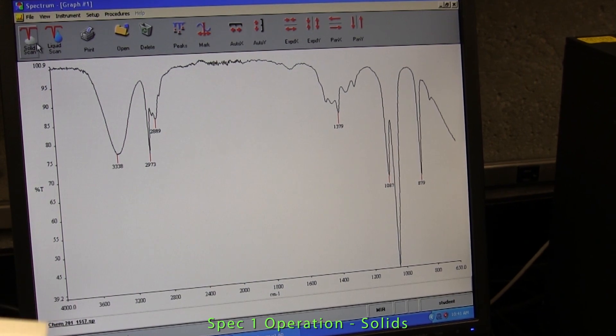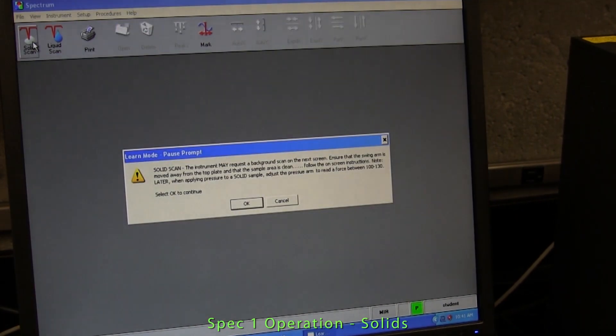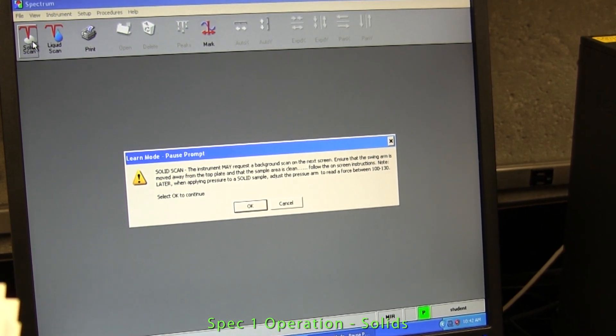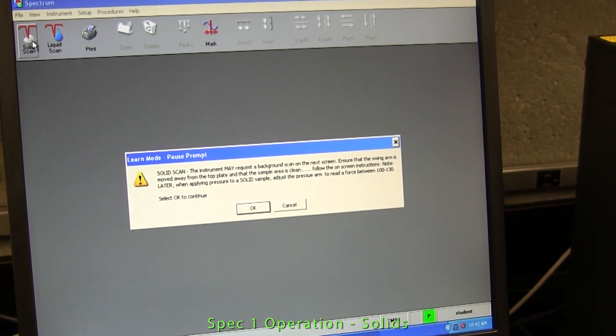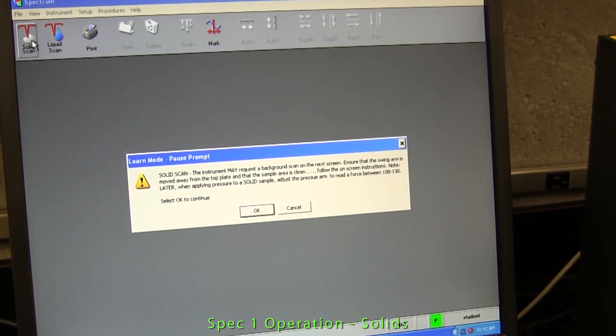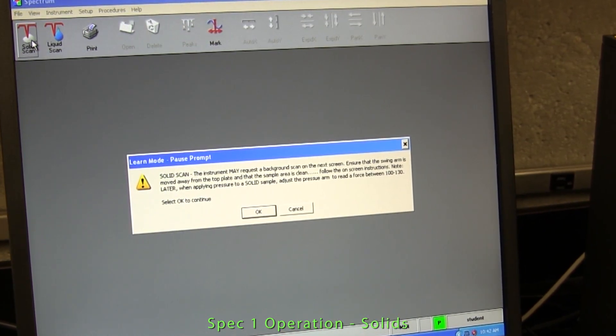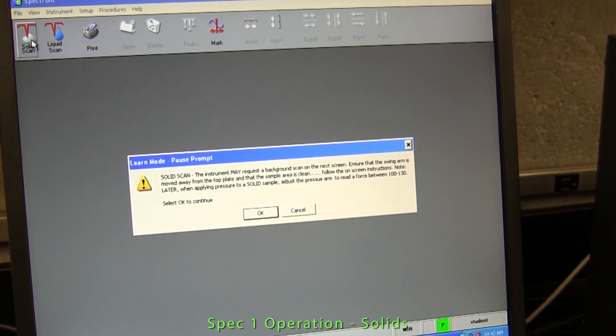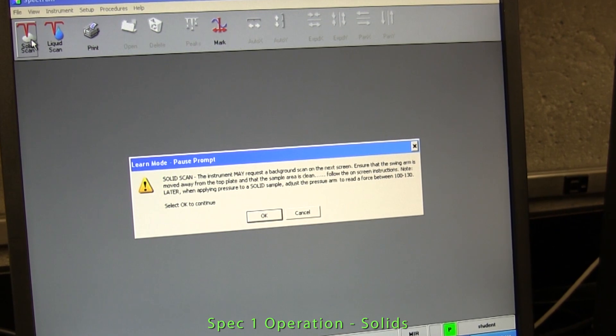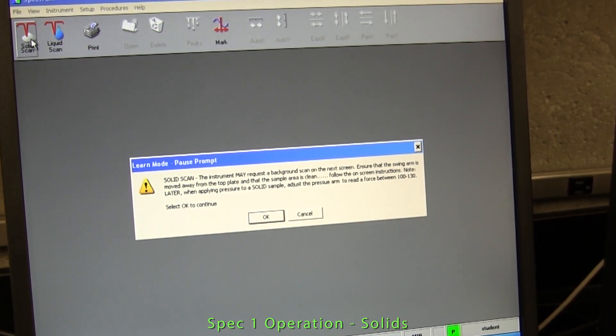Once you've instructed the instrument to obtain the spectrum of a solid, a prompt appears to tell you that the instrument may first request a background scan. If this is needed, the instrument will collect and store an IR spectrum of air. Since your sample is being run in air, in this way the instrument can subtract the spectrum of air from the spectrum of your sample run in air. Generally, the instrument will call for a background spectrum only when software is started up.